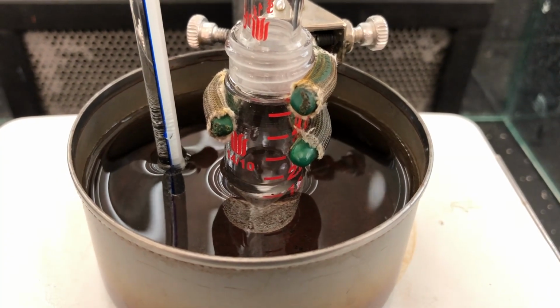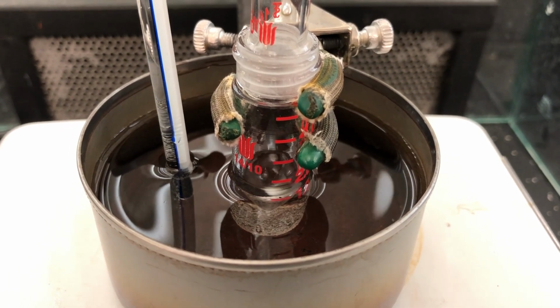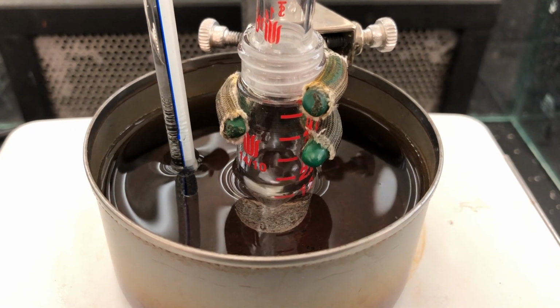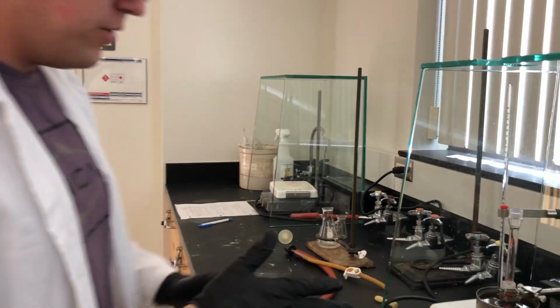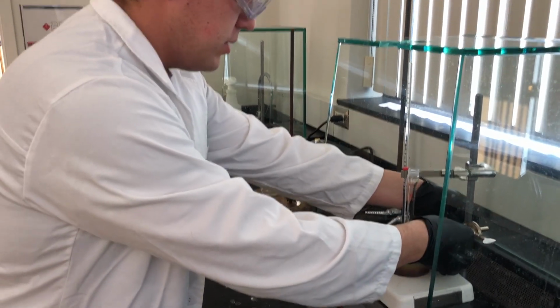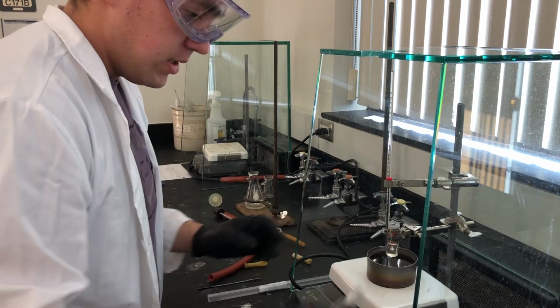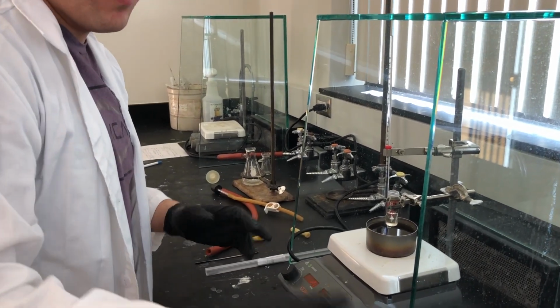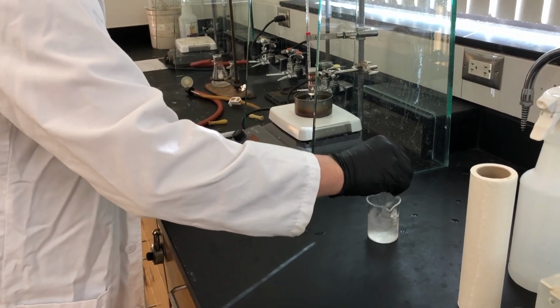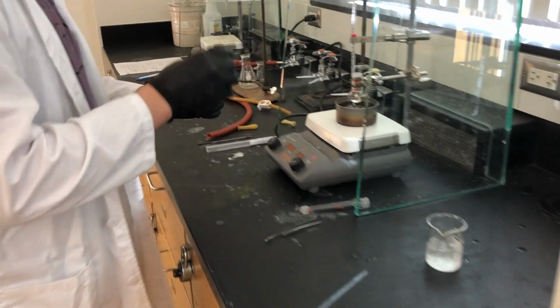Okay, so the salicylic acid has dissolved and now we're just heating it up at about 55 degrees Celsius for about 15 minutes. So it's been 15 minutes. We're going to turn off the heat. We're going to lift this out into room temperature. Take out the air condenser. Now I'm going to add about 1.4 milliliters of cold distilled water. This is just to react with the excess acetic anhydride in the conical vial.